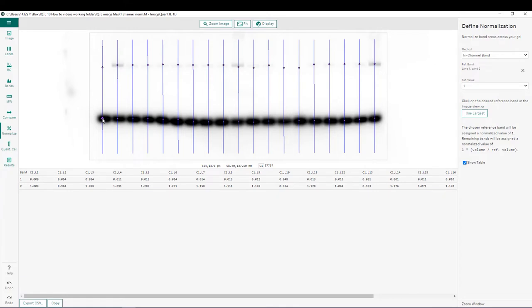Now that we've chosen our reference band, you can see we've started to populate some data down below in this table. Using a reference value of one, shown here on the right, we can now look at the relative loads from our loading control that we have in each lane. This will allow us to normalize our bands of interest above.